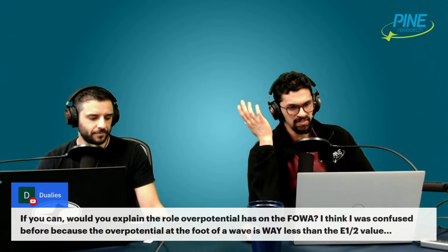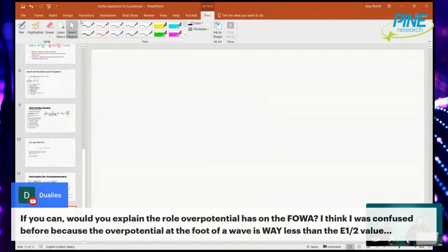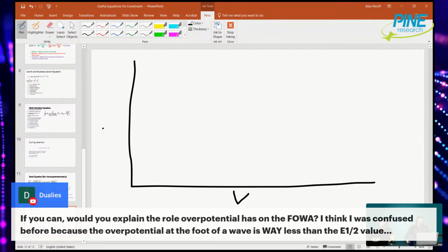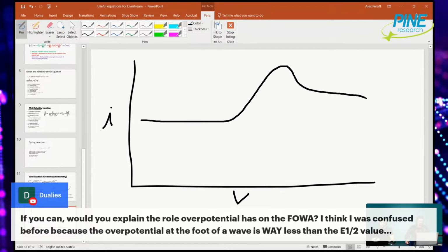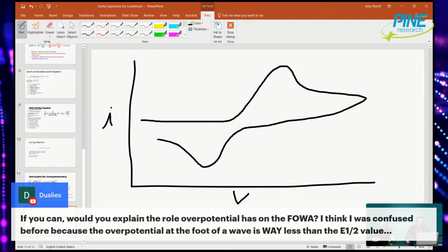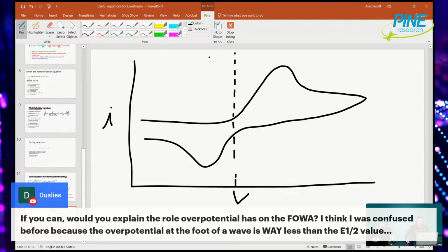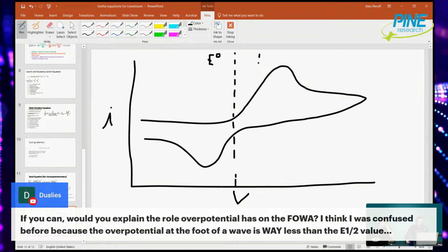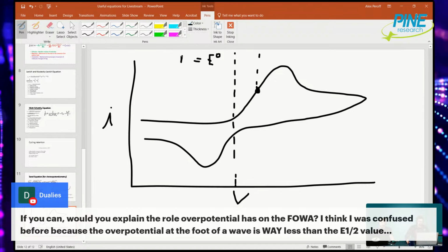So if you look at just any CV, let's look at this, and maybe using Math Live is a better way to do this. But I'm still trying to understand the question a little bit more. I'm just going to draw it exaggerated, just so that we have some space. We would say somewhere in the middle here is the E naught. But he's talking about E1/2, halfway up this potential here. No. So E1/2 is E naught. E1/2 is halfway between the anodic and the cathodic peaks. That's my understanding of what he's talking about.